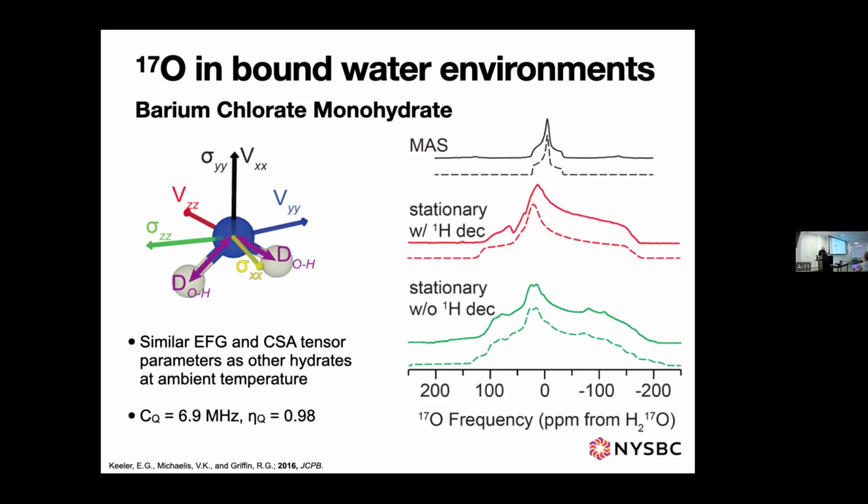So here I'm just showing on the water molecule different orientations of the tensors that were fit out, using quantum chemical calculations to help get the angles. The picture is actually coming straight out of the CASTEP calculation. There are programs that let you take the tensors and draw their principal axis components on, and then I added the dipole afterwards. So these are once again direct. So we take three different things.